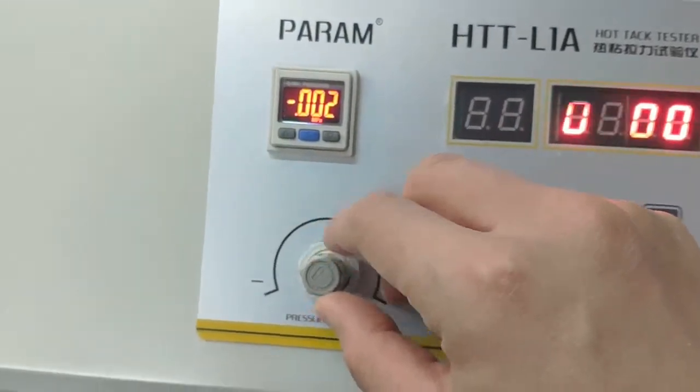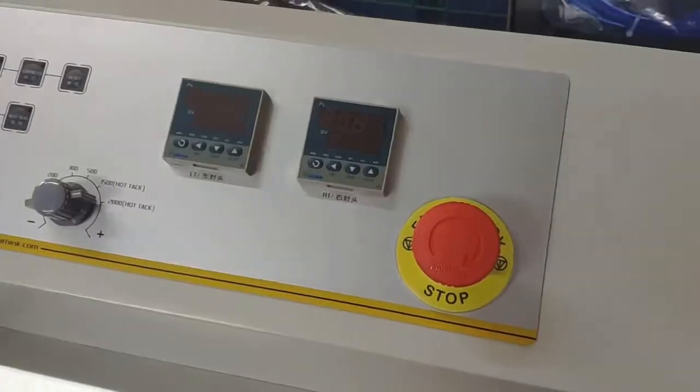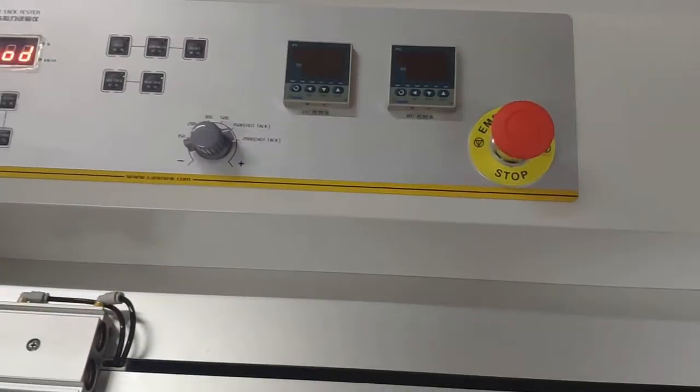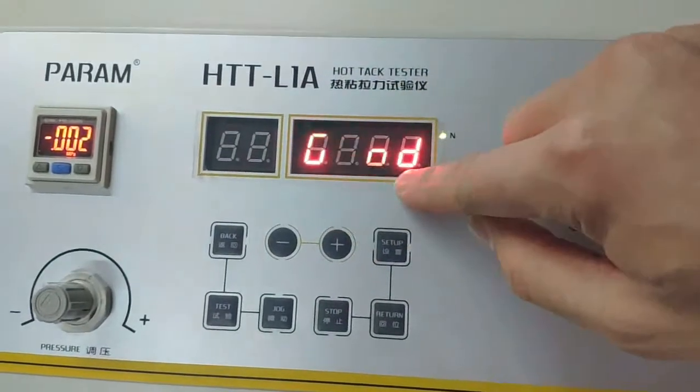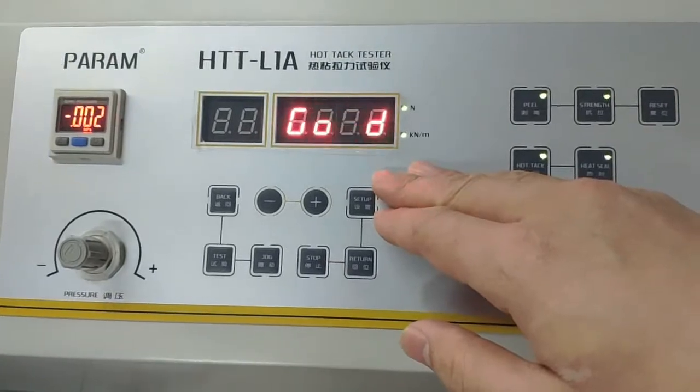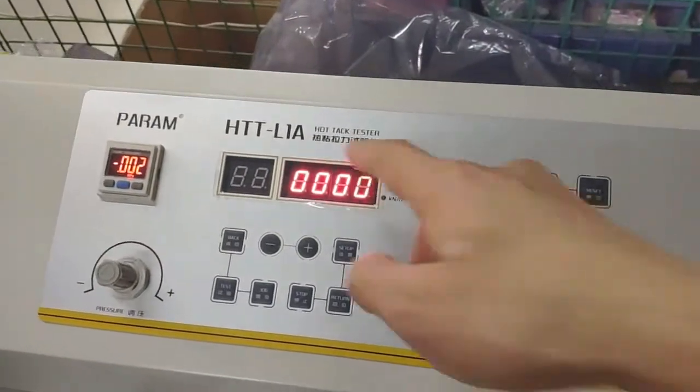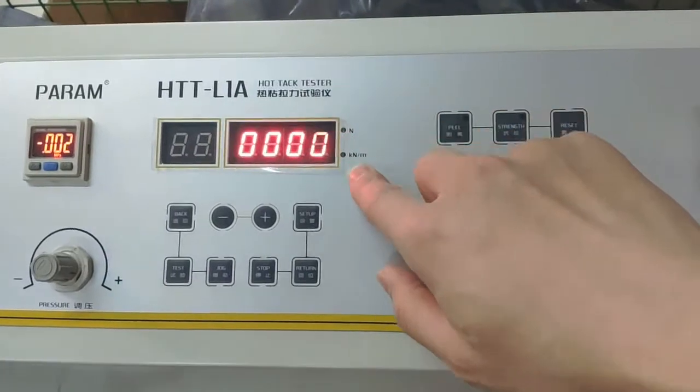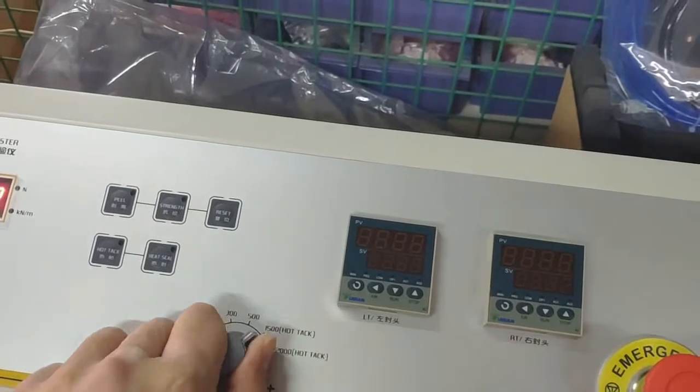Here is the pressure gauge. You can adjust the pressure by this knob. Now power on this instrument and you will see there is a warm-up time. It will require 10 minutes to finish the warm-up. After 10 minutes you'll come to this display, which means the warm-up time is finished.